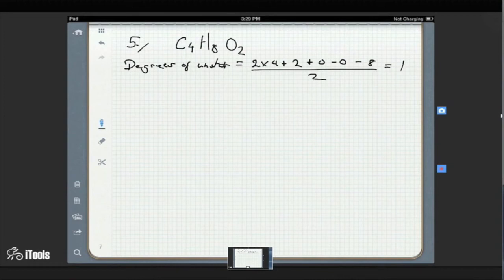What was the way to tell for carboxylic acid? It can't be a carboxylic acid because it's not intense. I'm going to go ahead and say that alcohol's in here. Carboxylic acids have to be from 10 to 12, so we know it's not a carboxylic acid. This 1H is a what? That's looking a little complicated. But this OH has to be attached to a C.